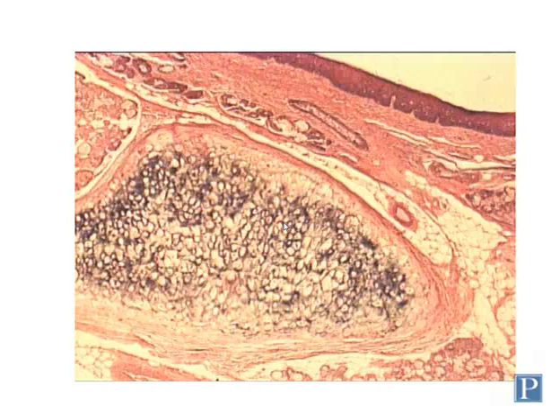So that's hyaline cartilage. Now let's take a look at another type of cartilage. This is a section from the epiglottis which contains elastic cartilage. Elastic cartilage is very similar to hyaline cartilage. Again, the matrix contains type 2 collagen instead of type 1 collagen, giving the matrix a very smooth, glassy appearance, just like with hyaline cartilage.